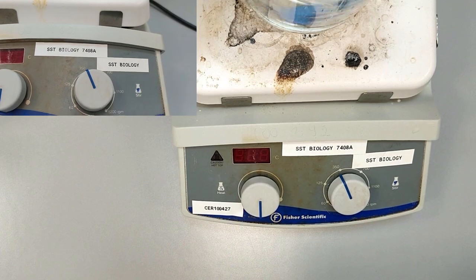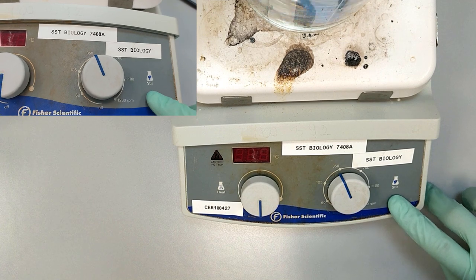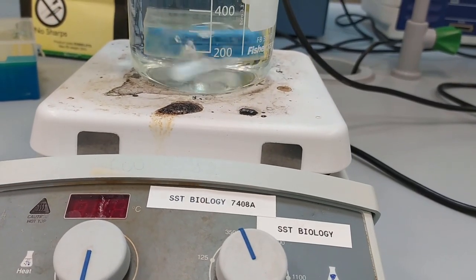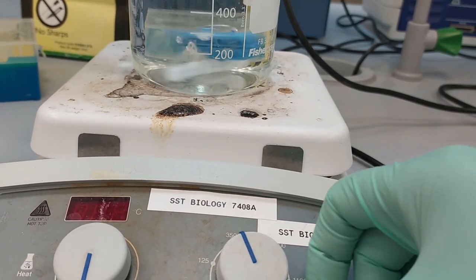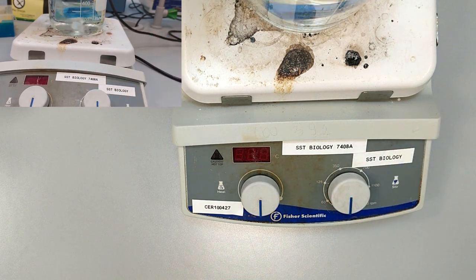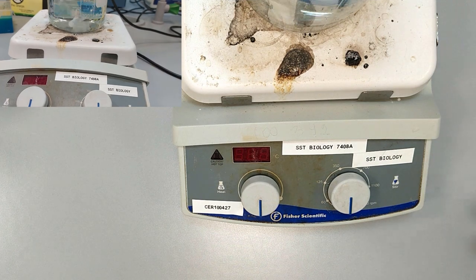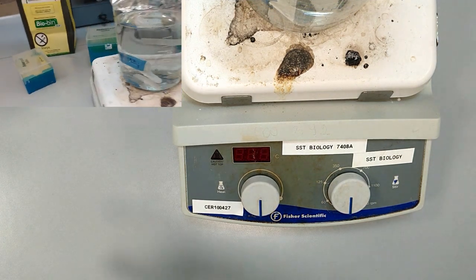Okay, so now we have 1 hour passed since the time of starting of the stirring, and here you can see how it stirs with the magnetic field. So now we are going to turn it off and put all of these beakers close to each other so we can start comparing them.